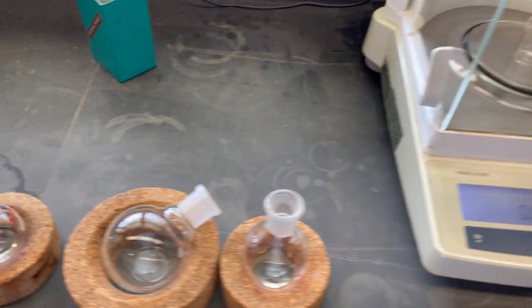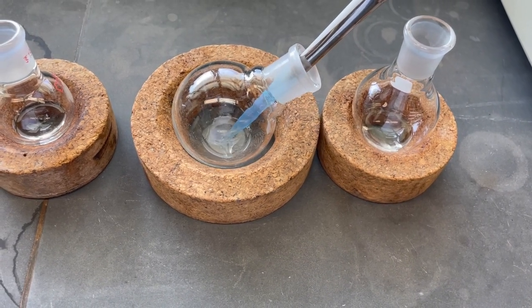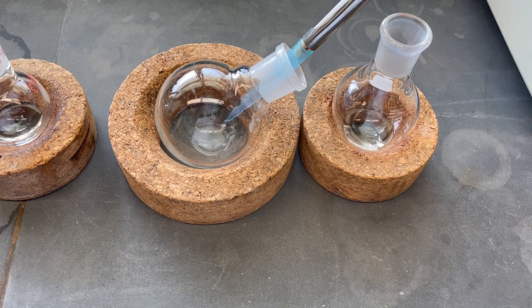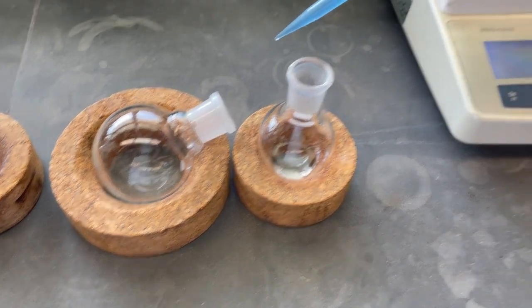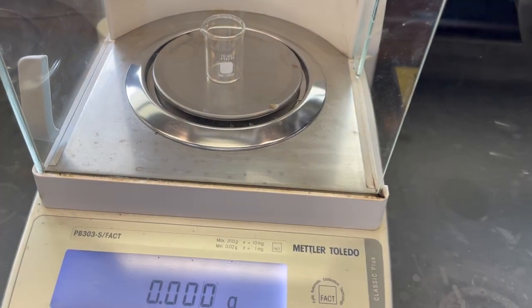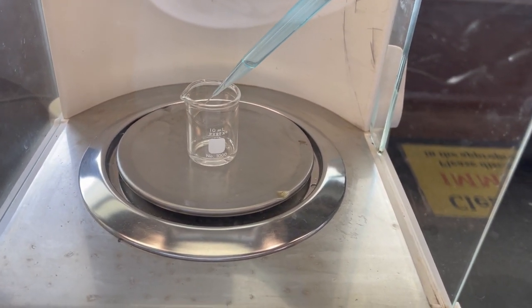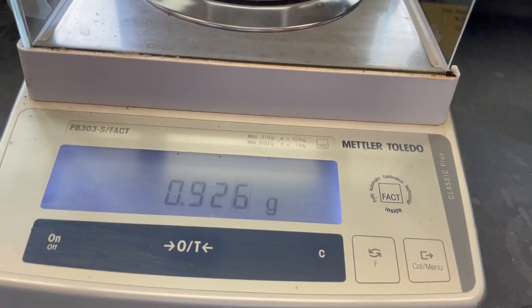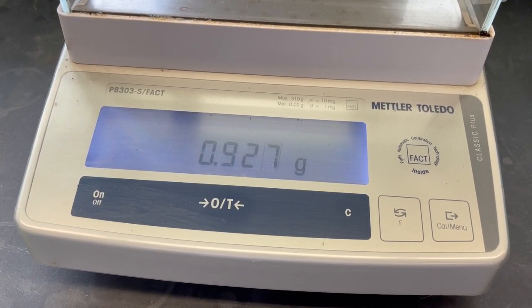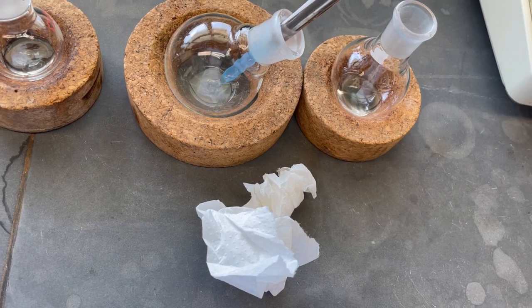All right, we got this one. I cleaned them out, dried them up, tared them. Now we want to get the second one. Let's see what we've got here. Careful not to spill because I'm filming and chemistry-ing. I forgot my tripod again. So let's take a look-see. Ooh, 0.926, already garbage. All right, so 0.926, write it down. I want to take another one of these right here just because that second measurement wasn't so great.